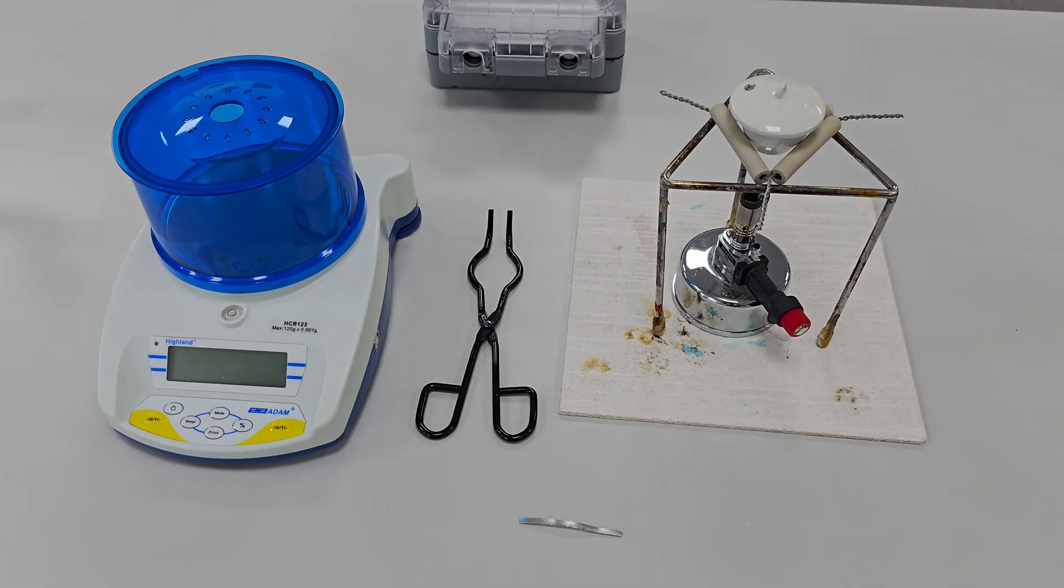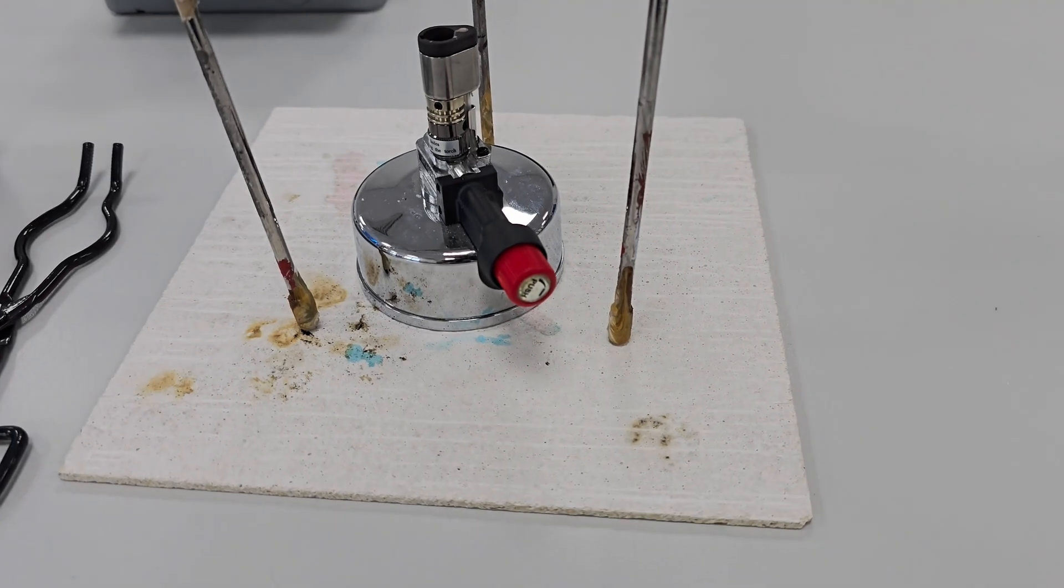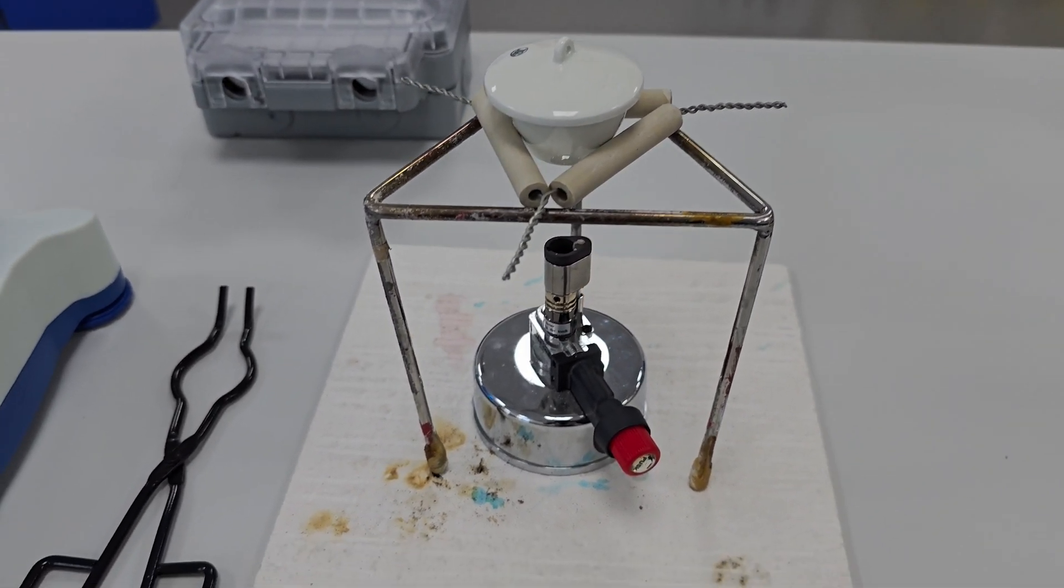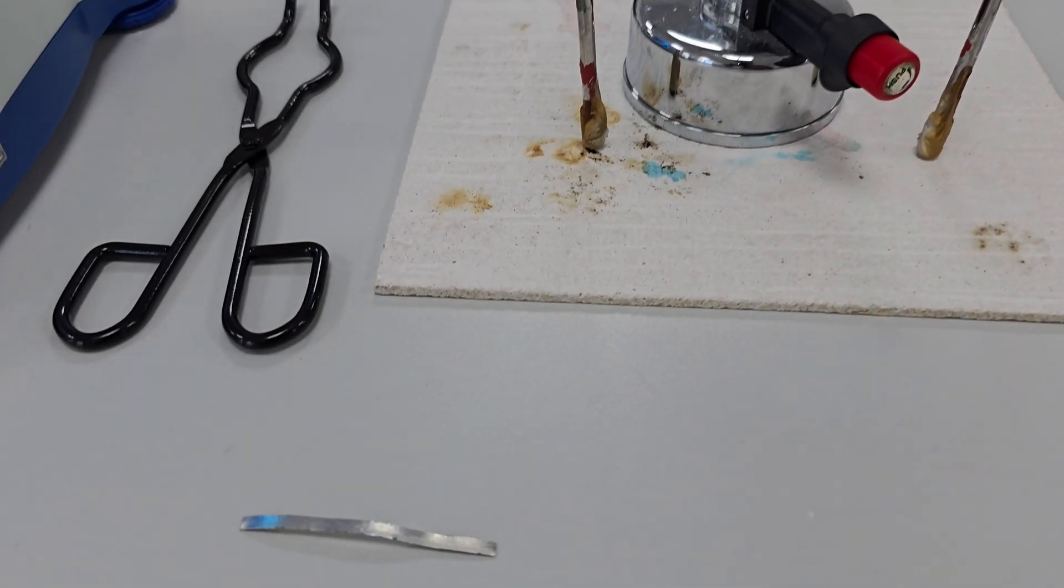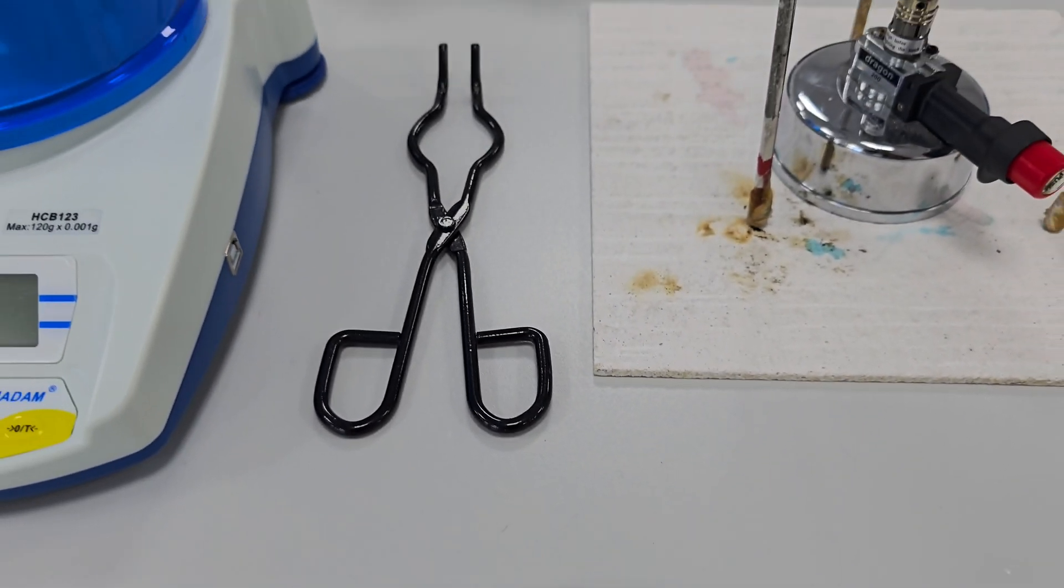I'm going to show you how to experimentally determine the empirical formula of magnesium oxide using a simple combustion experiment. We'll use a six centimeter strip of magnesium ribbon, a crucible, some heat and a little bit of chemistry to find out exactly how magnesium combines with oxygen.